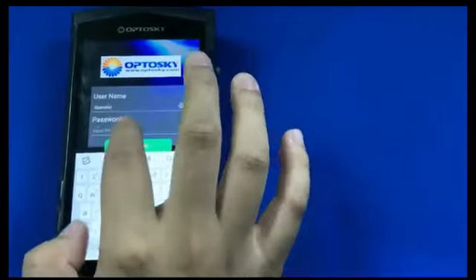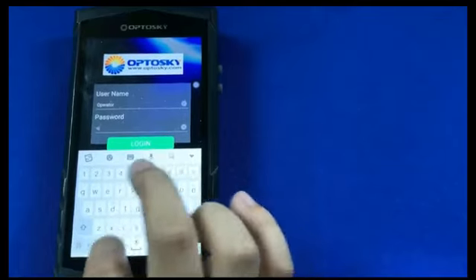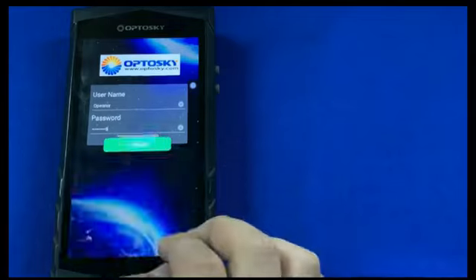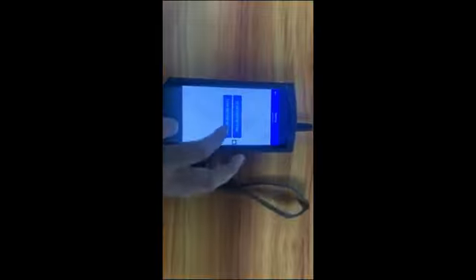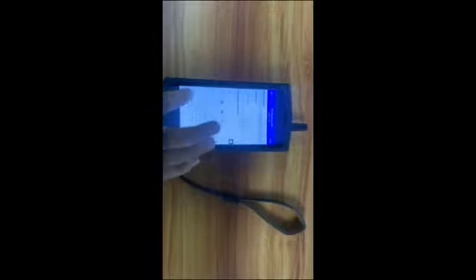You can put 100 power test 100 measure, and remember to set up a longer integration time, such as 15,000, and laser power is 100, and then you return to the main menu to detect the scan.